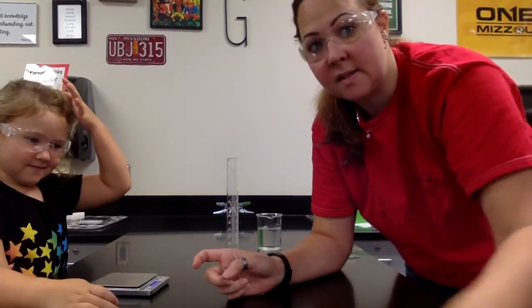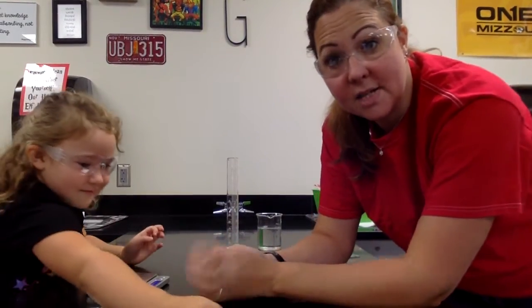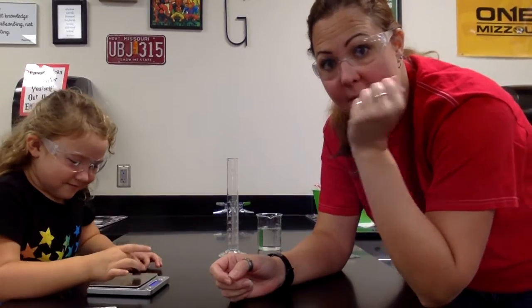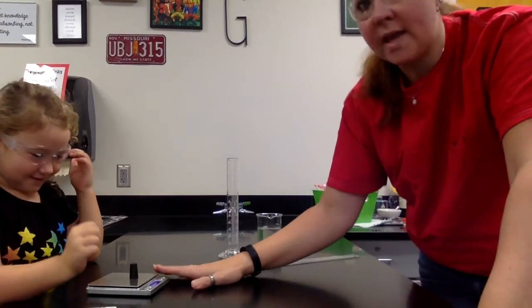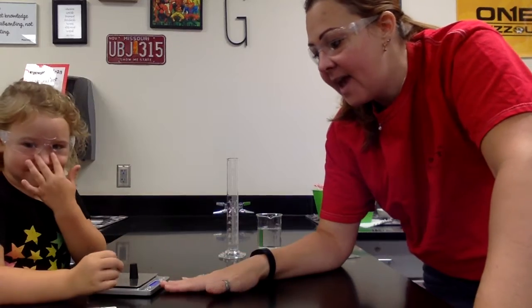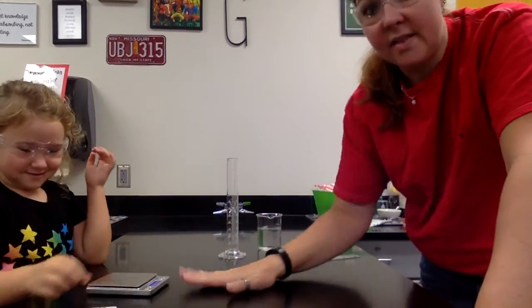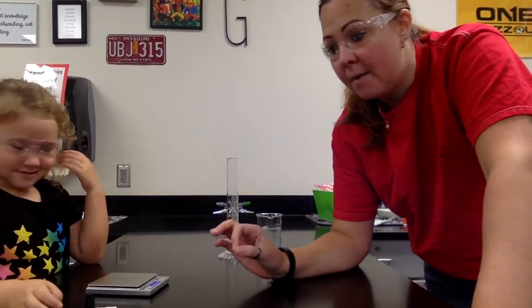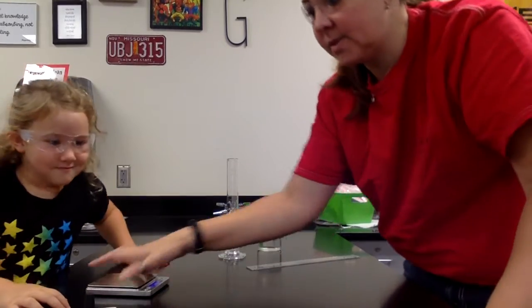Whenever we write down numbers in data tables in this class, you always want to make sure that you have a unit attached to your number. So I'll write down 13.96 G for grams on my lab data, but yours is already given. For my irregular shaped objects, Lillian just put it onto the balance, and it says that it has a mass of 6 grams. So again, that's already on your lab paper, but finding the mass is just using a balance and writing down that number in grams.